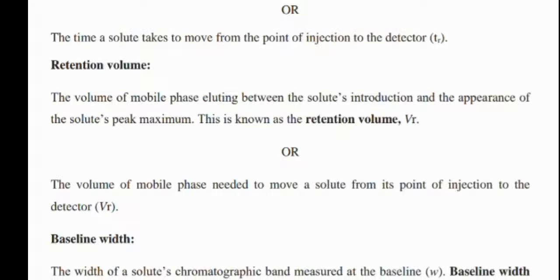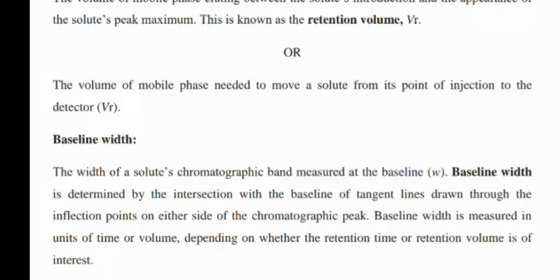Another one is the baseline width, the width of the solute's chromatographic band measured at the baseline. It is determined by the intersection with the baseline of the tangent lines drawn through the inflection points on either side of the chromatographic peak.